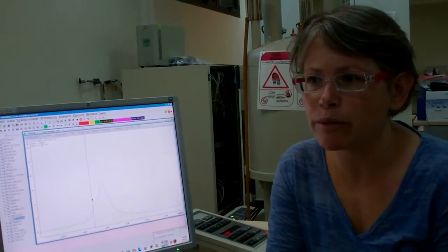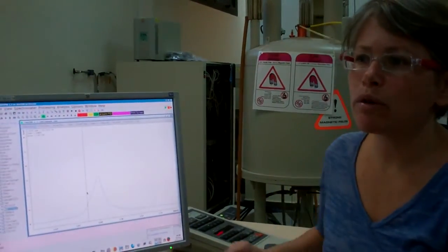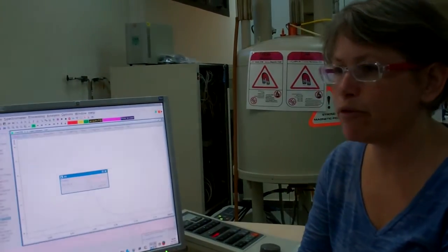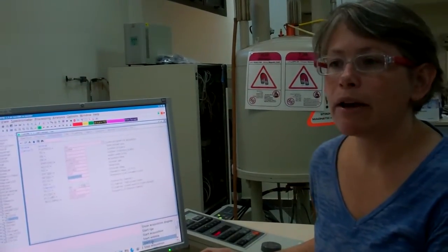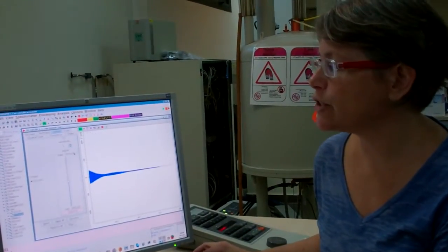To see the effect of the shim gradients on the proton spectrum in real time, we're going to enter Go Setup mode. First, we're going to change D1 to 0 seconds. D1, enter 0 seconds. To enter GS mode, I can right-click on the acquisition window and go into Start GS. That will bring me into this red acquisition window.